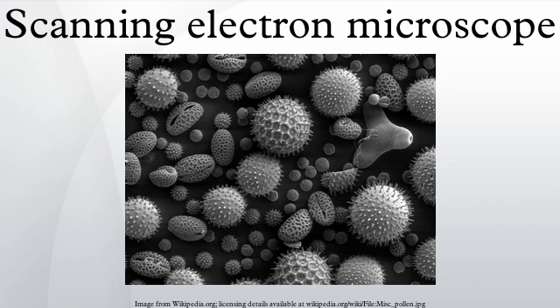Examples are the energy dispersive X-ray spectroscopy detectors used in elemental analysis and cathodoluminescence microscope systems that analyze the intensity and spectrum of electron-induced luminescence in geological specimens. In SEM systems using these detectors, it is common to color-code the signals and superimpose them in a single color image, so that differences in the distribution of the various components of the specimen can be seen clearly and compared.